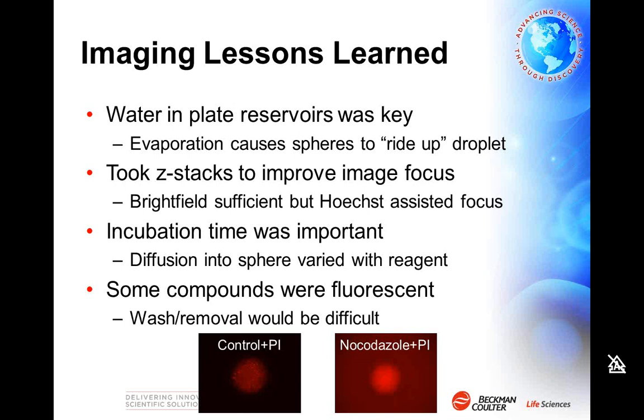In addition, we found that incubation time was important, and that's to be expected, as Nikki touched on, where the diffusion gradient into spheres can be a significant factor. And there were even some differences based on what reagents you were using.